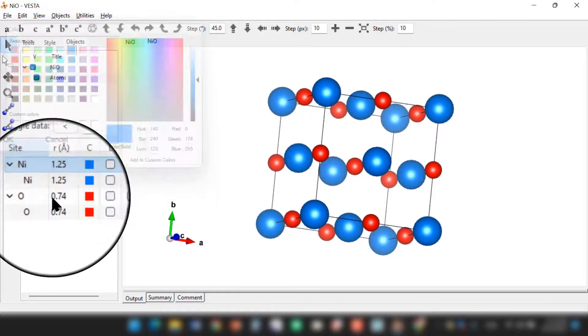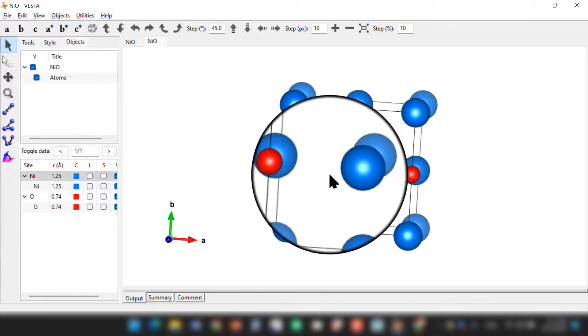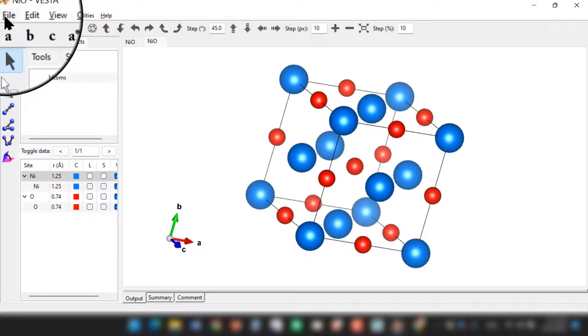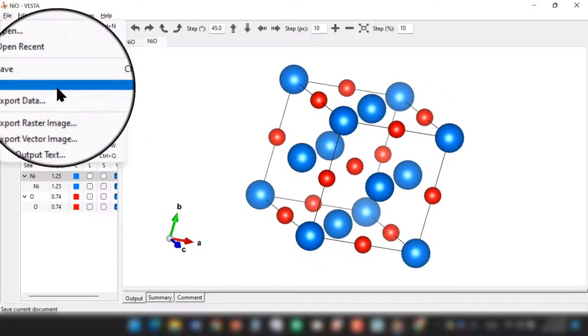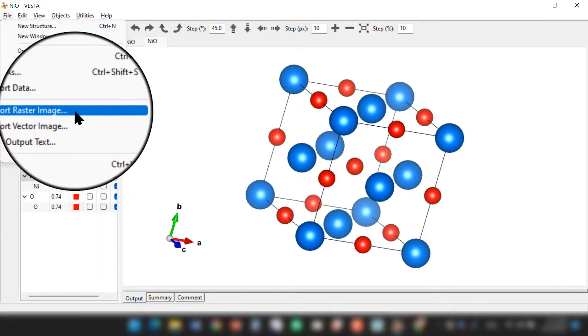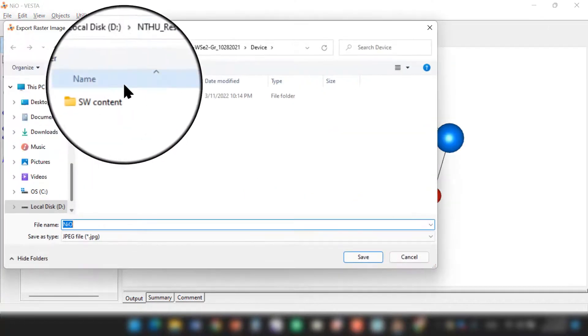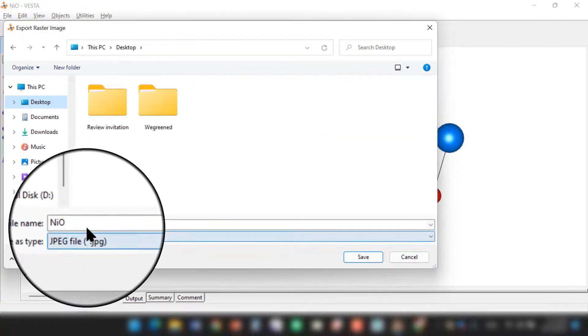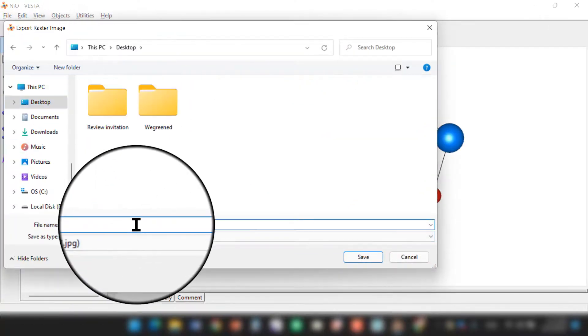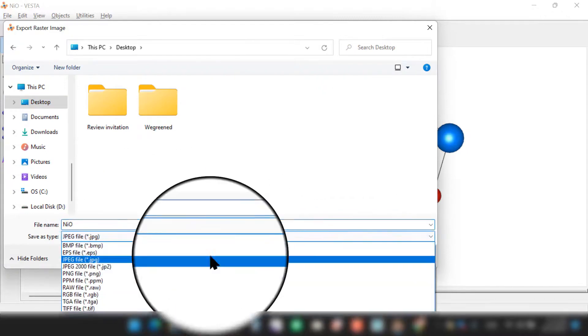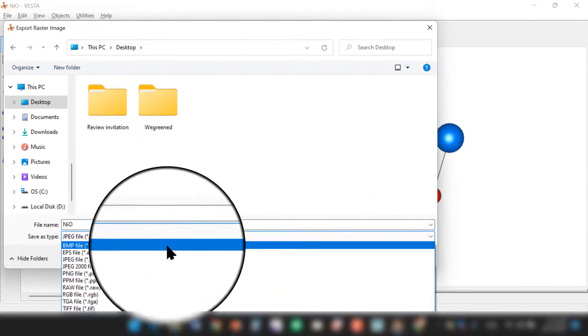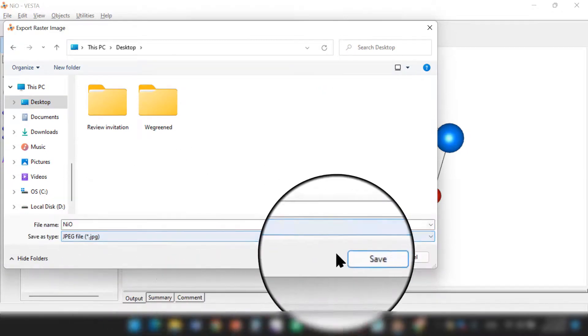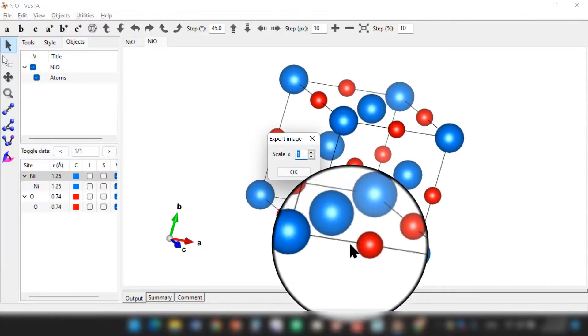And then you can go to File, Export as Raster Image. You can see over here on desktop, this is nickel oxide jpg. You can choose different file formats. I chose here jpg and just save it.